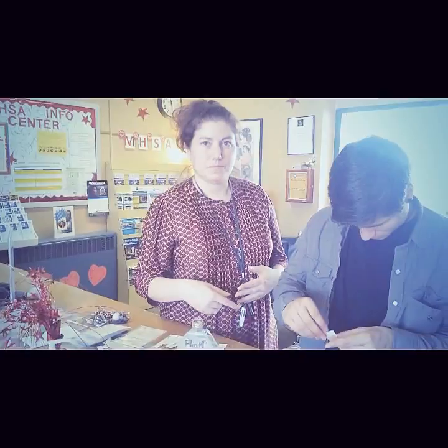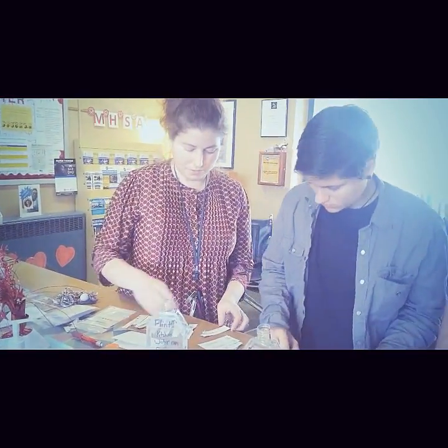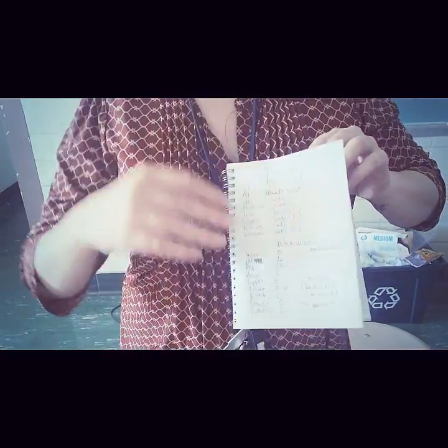So does this count as being very acidic then? This is not horribly acidic. It is slightly acidic. A lot of water is because of the amount of fertilizers and fluids that we have in the water. The results were fairly consistent.